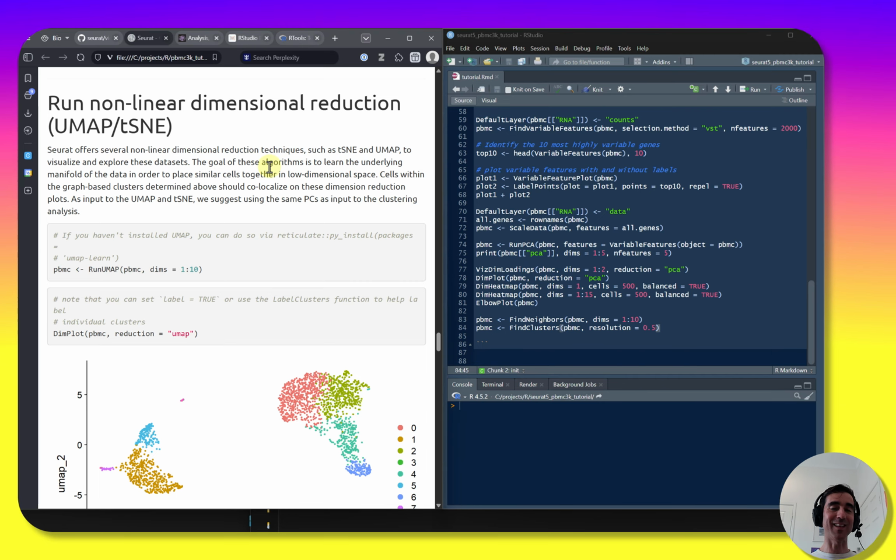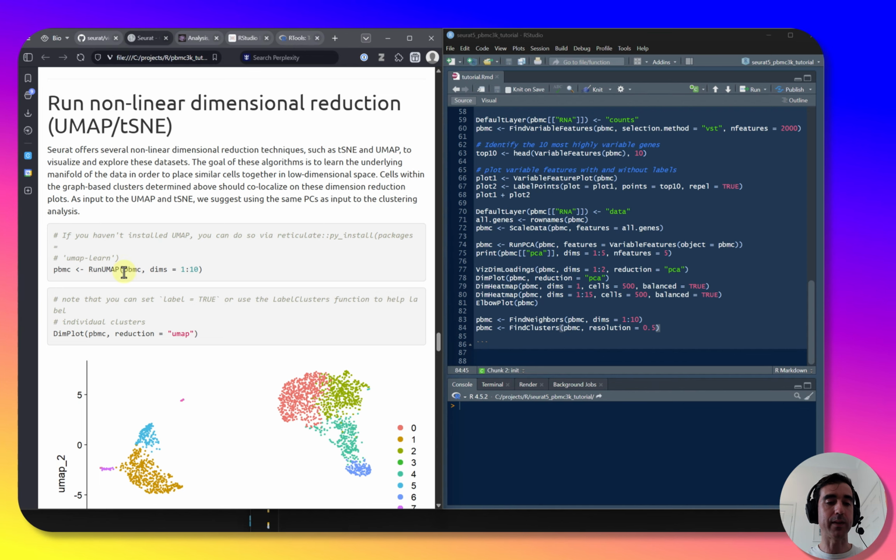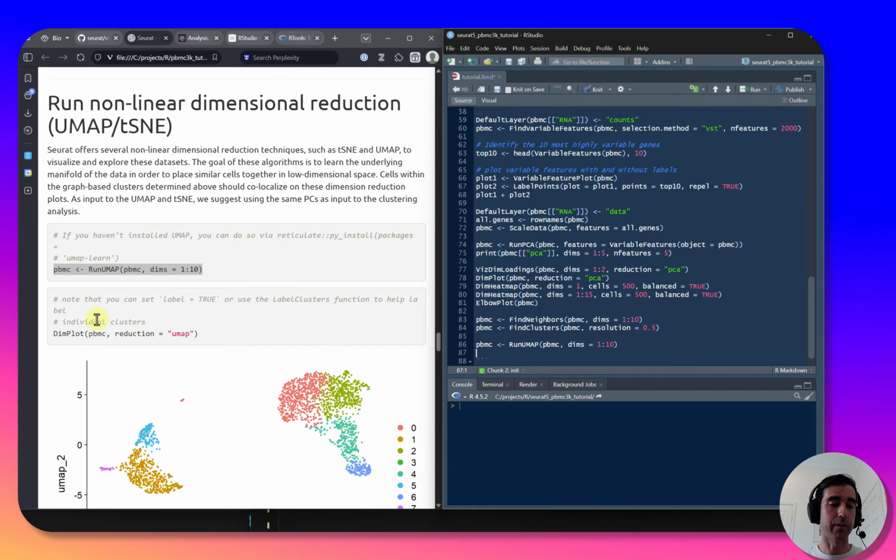So imagine a 10-dimensional space. I'm sure that you can do it. Our clusters are grouped into that space. But now we want to project that 10-dimensional space into a 2D surface that we as humans can easily process. And that's what UMAP does. It takes that 10-dimensional space and projects it into a boring 2D figure.